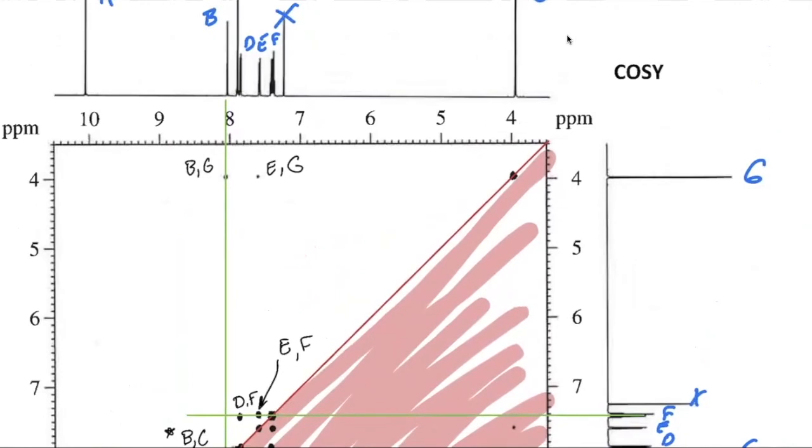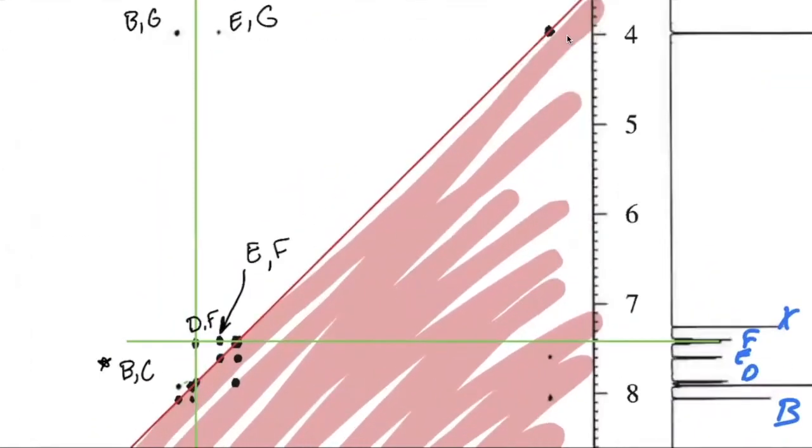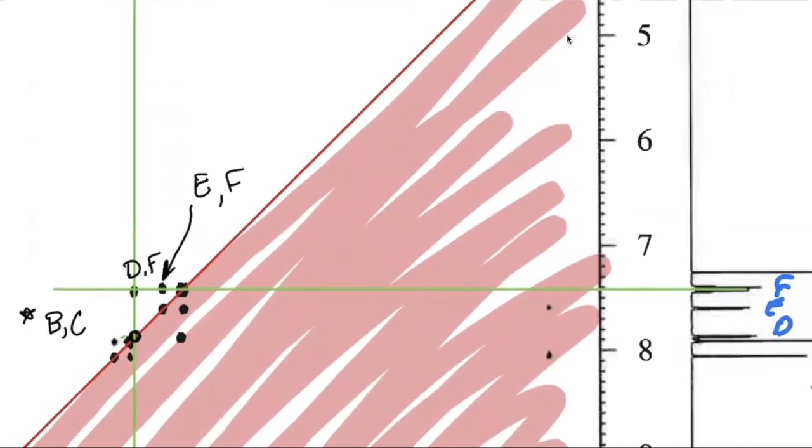Okay, so bringing this line over now and zooming back into our region of interest. What I'm seeing is that this cross peak that I've labeled D here seems to line up with the center of this smaller portion of the cross peak, which we agreed based on our earlier analysis corresponds more closely to this D peak here and not so much to the C peak. So I am feeling pretty good about the assignments as I've labeled them right now.